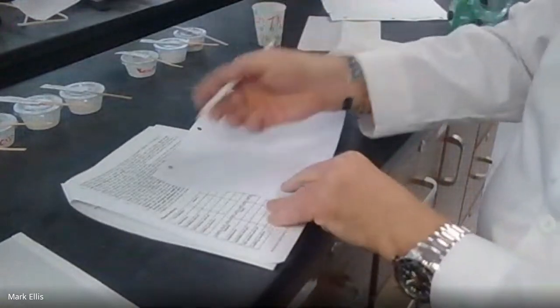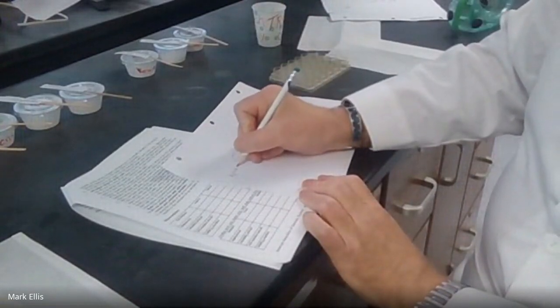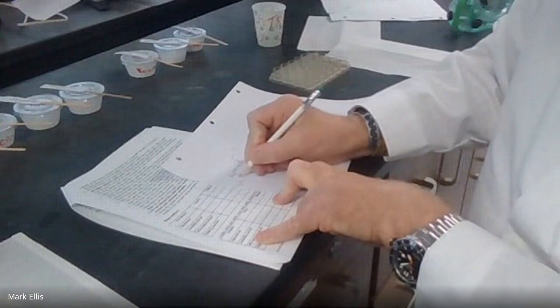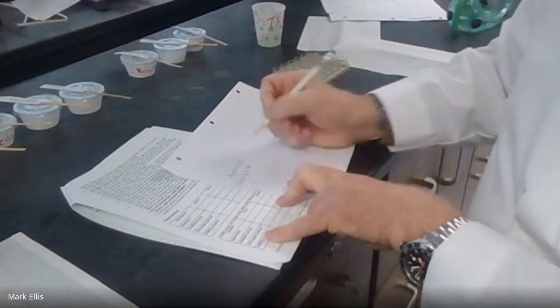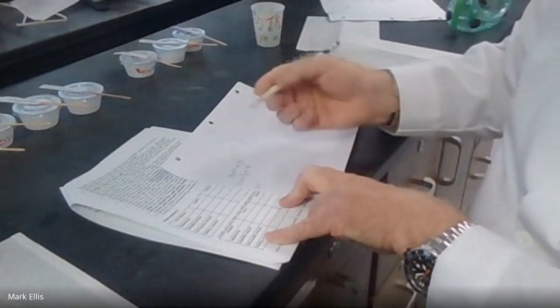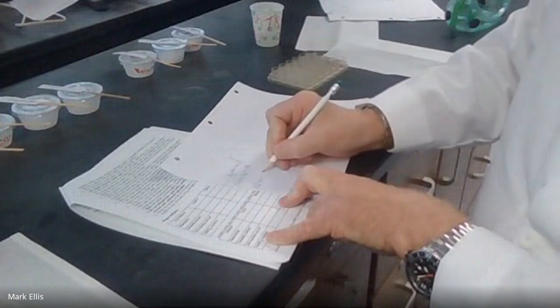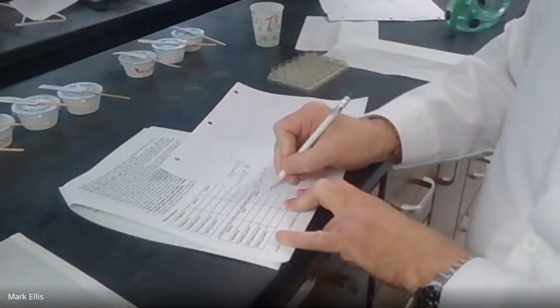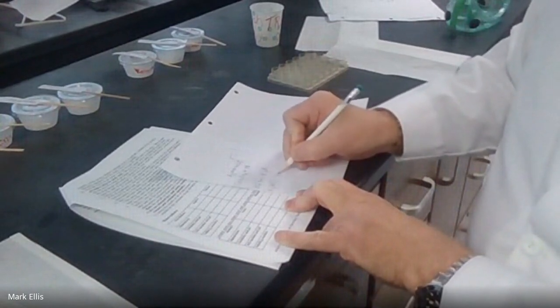So the first thing is the appearance. Even though most of these look the same, the appearance might give something away. And then solubility and pH. Next is our HCl reaction. An abbreviation for reaction is RXN. And then we'll also do the pH. And then the last one is the iron 3 nitrate reaction, RXN.